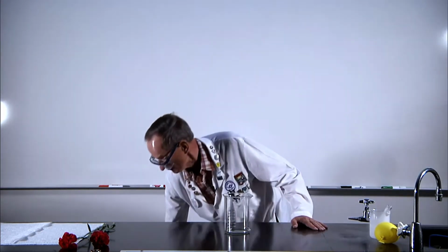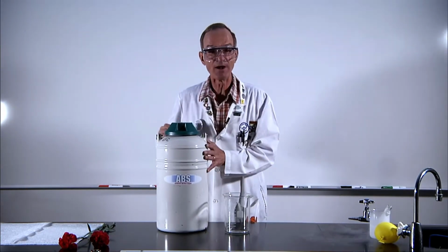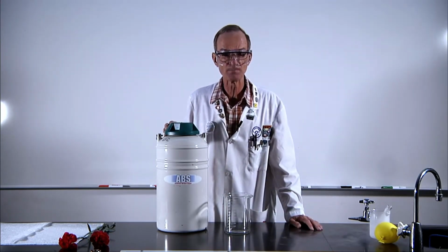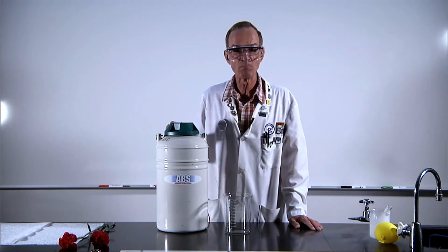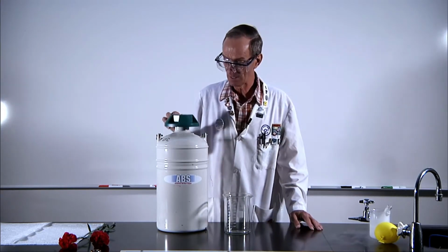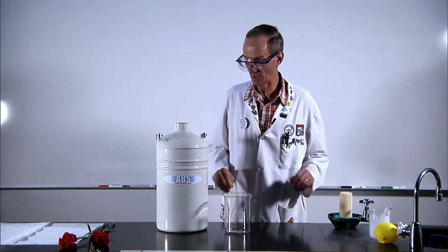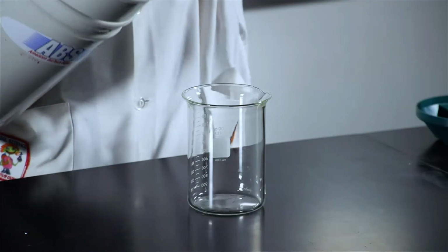What I have in this container right here is some nitrogen from the air that has been liquefied. In order to do that, we have to get the temperature down to minus 320 degrees Fahrenheit, almost minus 200 degrees Celsius. Now what I'm going to do is pour some into this beaker right here that we have on the tabletop. And you'll notice something happens right away.